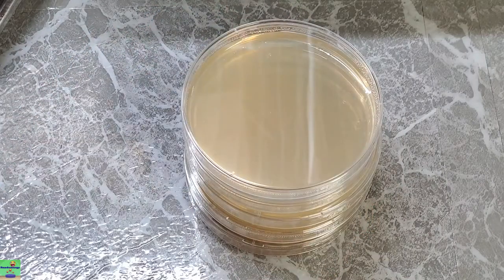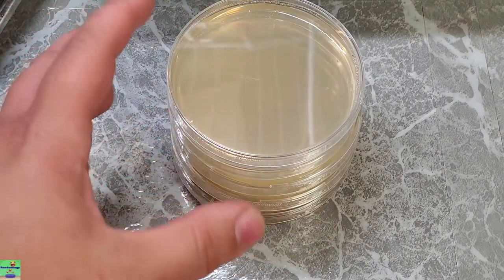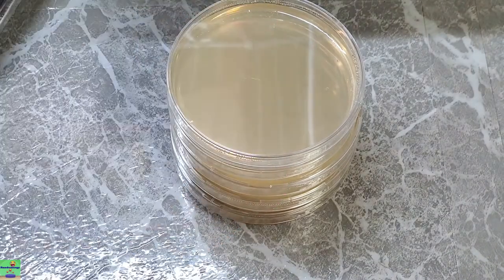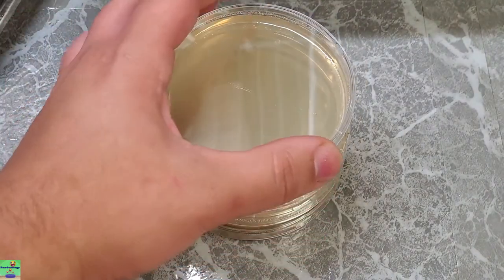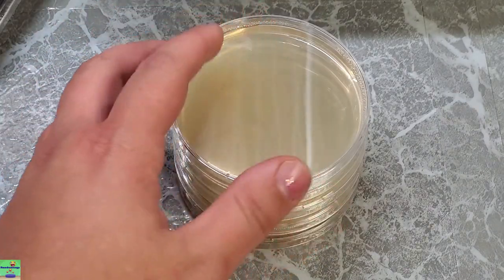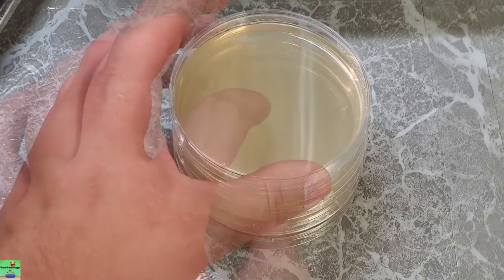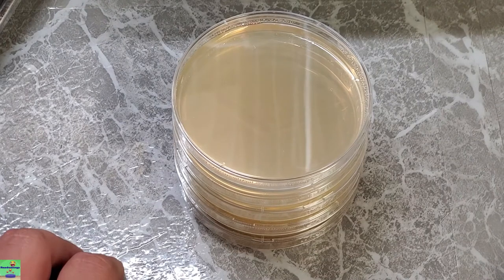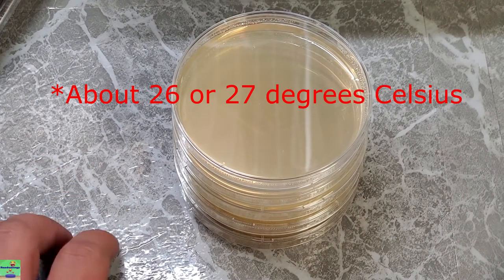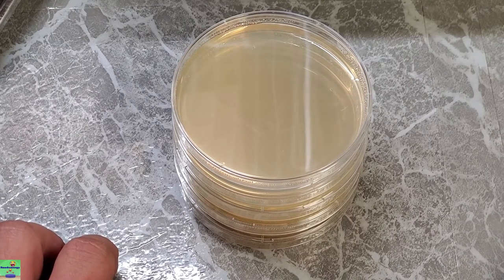That right there is pretty much the easiest way that I've found that you can successfully transfer spores from a spore print onto agar. And like I said, you'll deal with contamination here and there, but it's pretty easy to isolate a culture once it's on agar. I'll incubate it at about 82 degrees Fahrenheit, and we'll just see how it looks in 3 days, and I'll keep making videos about it.